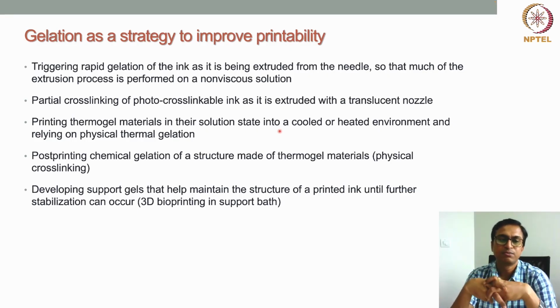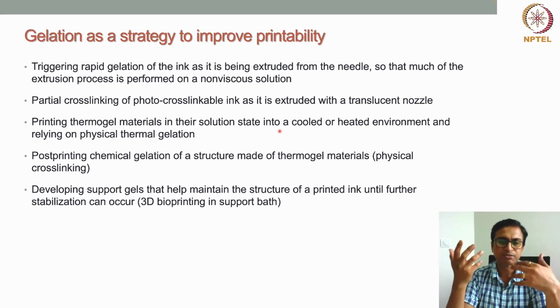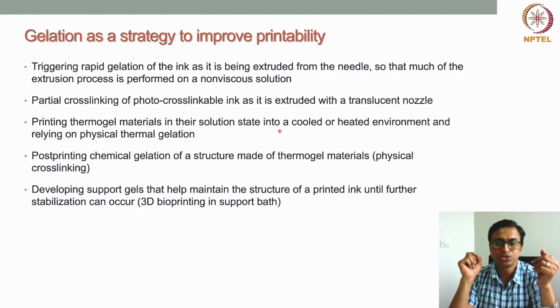After printing is done, we know that thermal gelation cannot provide long-term stability. After a certain time, the material can get deformed.